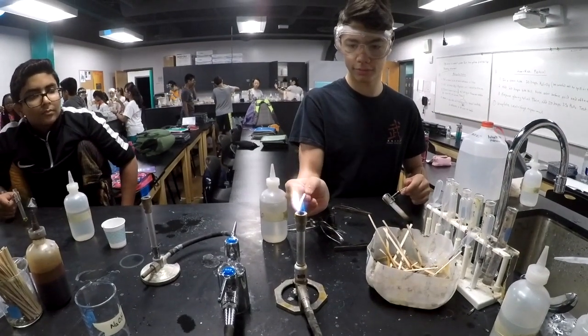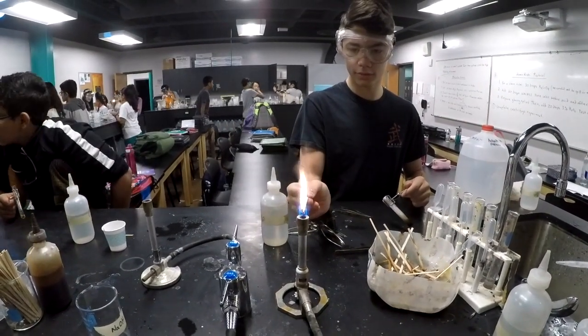Let's see the flame test again. What element is that? The test tube.